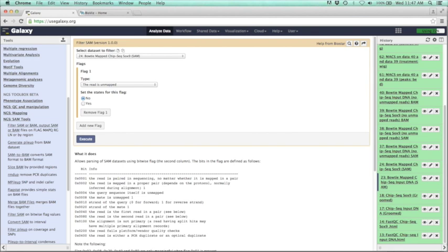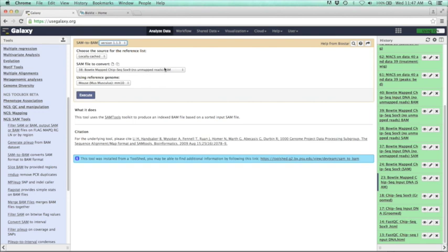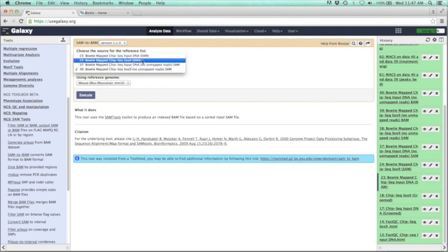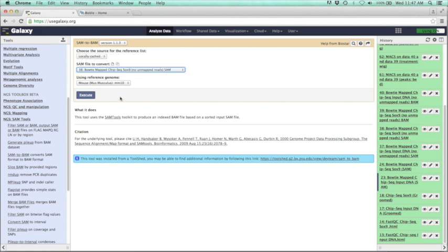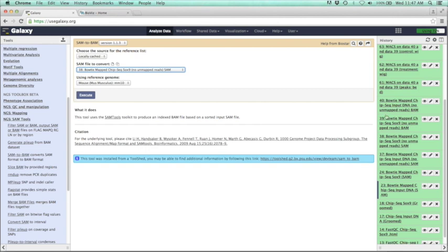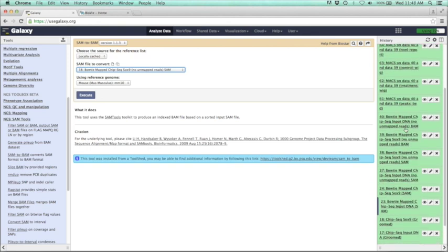Before we call peaks, let's convert the Bowtie data from SAM to BAM format. This will be important since we want to be able to view these reads in IGB later, and the easiest way to do that is to use the BAM files. Go back to the toolbox, then SAM tools, and click SAM to BAM. Make sure you have your no-unmapped-reads SAM files selected, execute for both files. Now we have our two BAM files, one for ChIP-seq input DNA and one for SOX9.